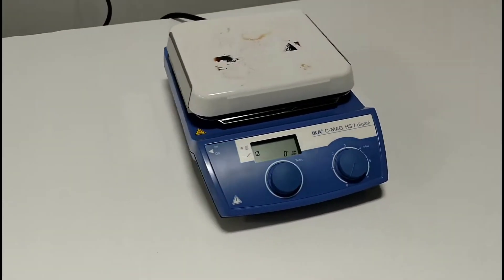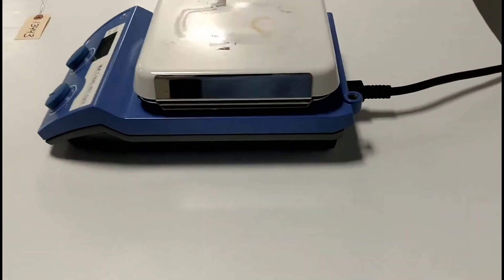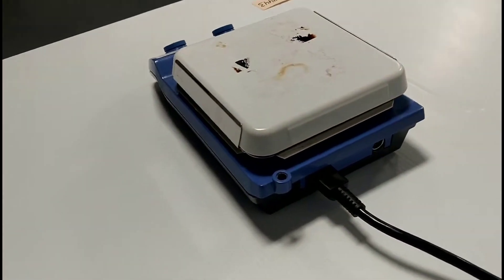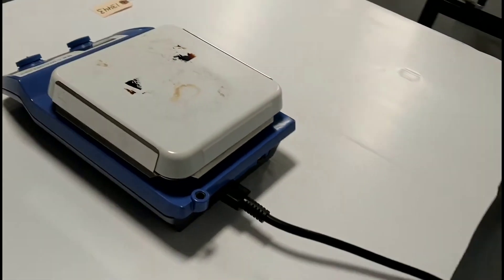Number 1: ICA Works Inc. The ICA Works Inc. unit has a 10-liter capacity, and safety-minded individuals will appreciate its temperature warning light, which tells you when its surface is too hot to touch.